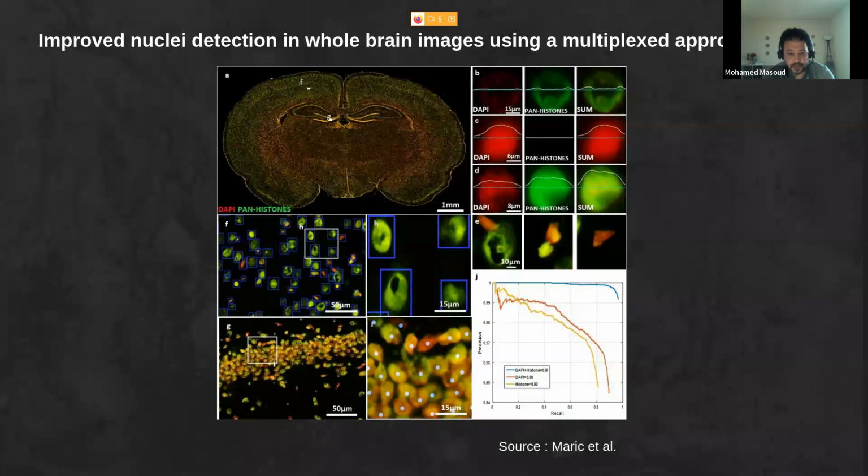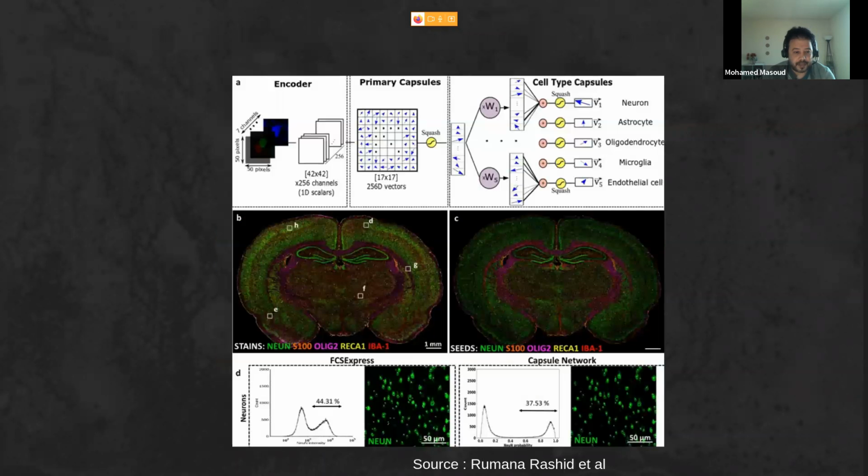But when they combine both, it gets like 0.97. So this step, they use it in the next part when they're trying to make classifications for the cell.